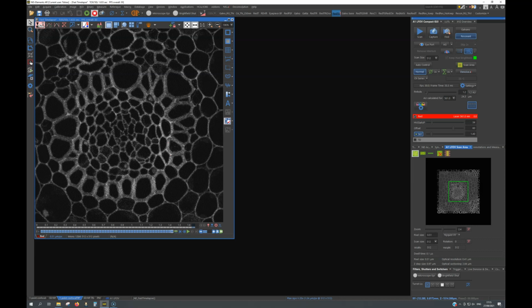We can see that there is noise in the image, but from one image we do not know how much signal and noise there is in one pixel. However, as we have acquired multiple images, we can compare one and the same pixel in different frames and calculate the signal-to-noise ratio in this pixel. This is of course best done by a computer, but if we make a movie of the frames, we can get a sense of the signal-to-noise ratio.